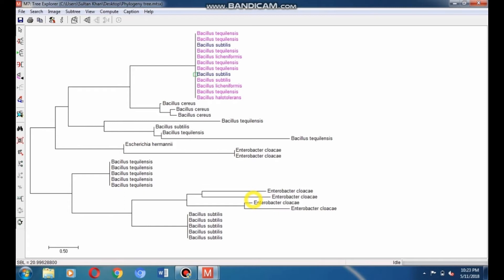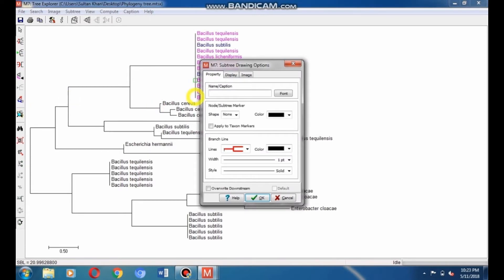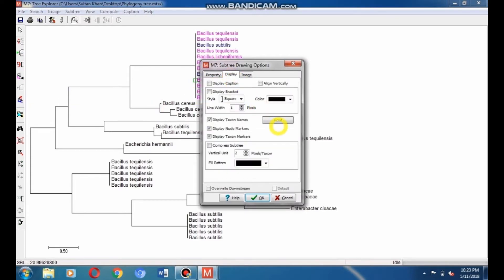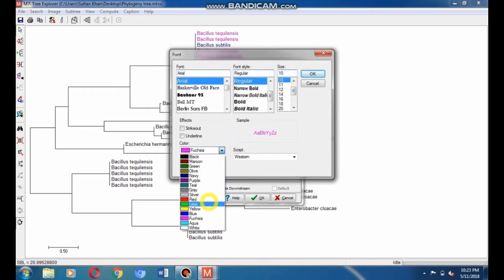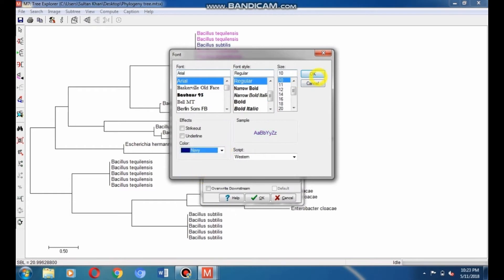Like this, change the color of the other Bacillus satelis species by repeating the previous procedure. Go to subtree drawing option, click Display, select Font, and choose navy color. Click OK to apply it. Now all three Bacillus satelis species are changed to navy color.